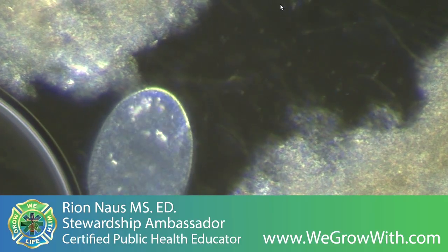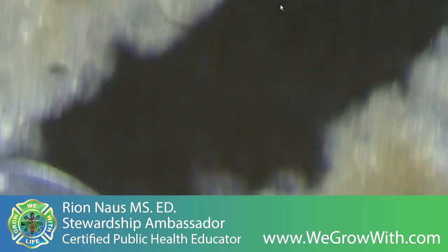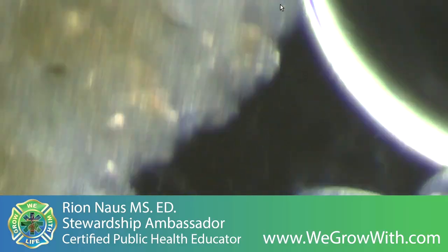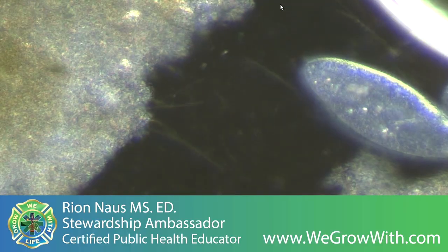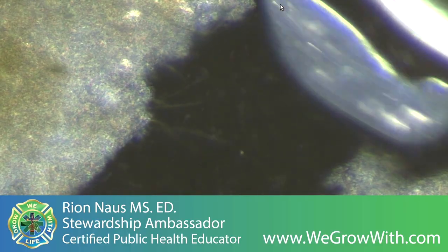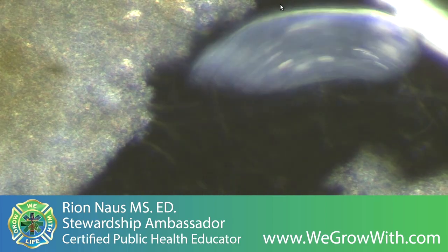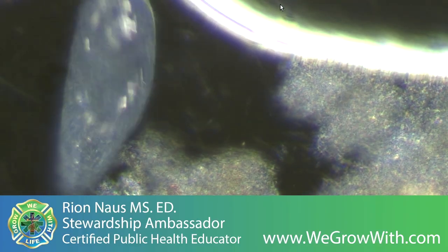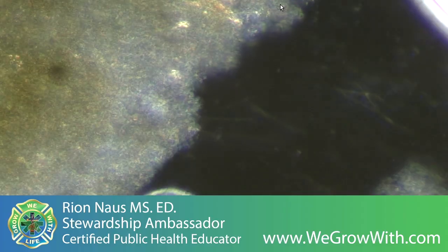So this is now, even though it's a single spot, there's a micro, wow, look at that, pressure pocket that is freaking cool.